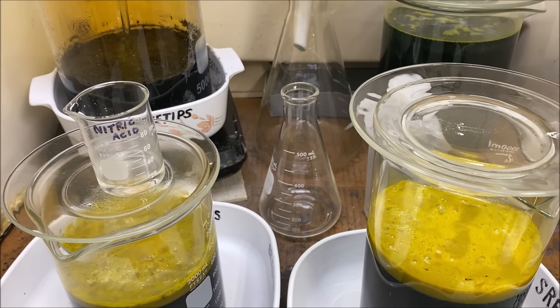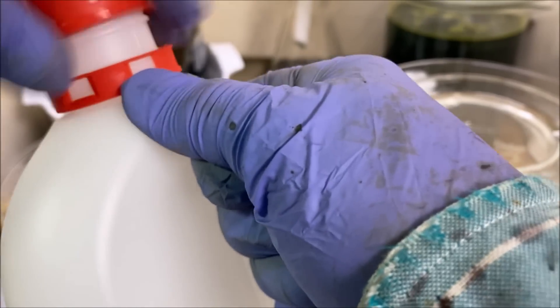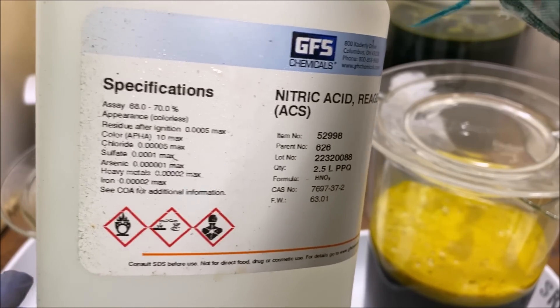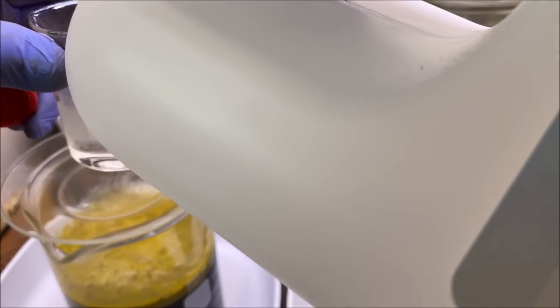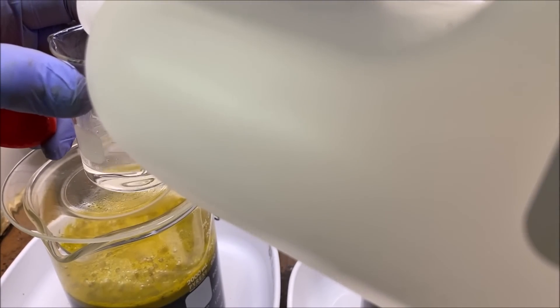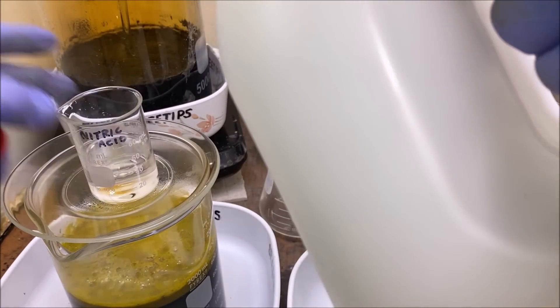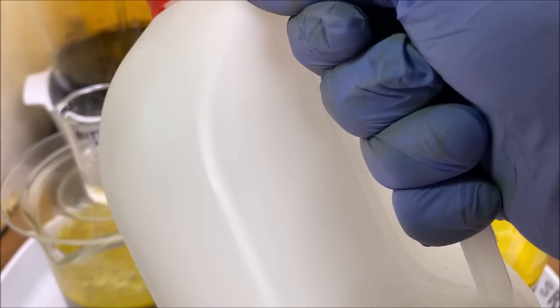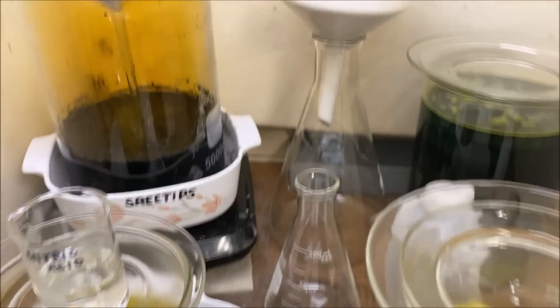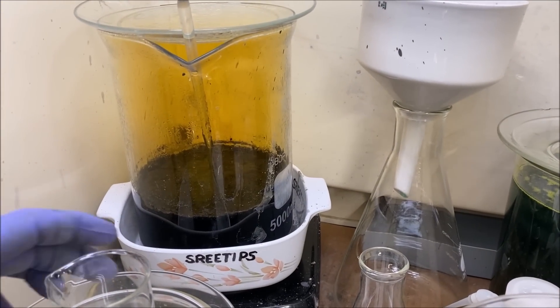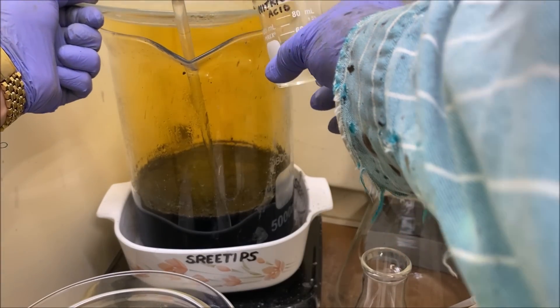Welcome back to part two of the silver cell anode filters refining series of videos. I've got some nitric acid and what I've been doing is adding small doses of nitric acid to our solids and just observing how it reacts. What I want to do is only get to a point where it's real hot.